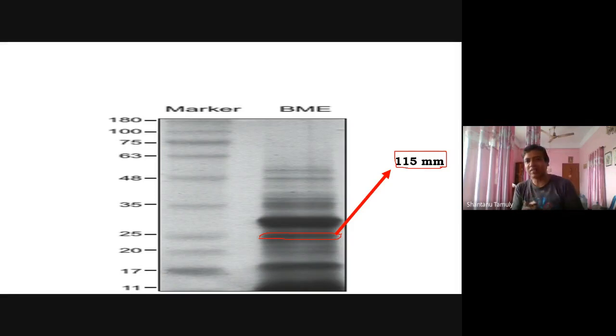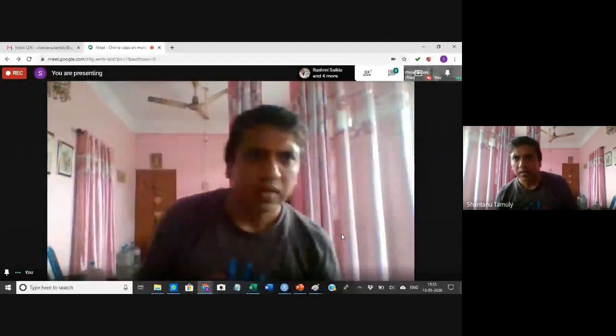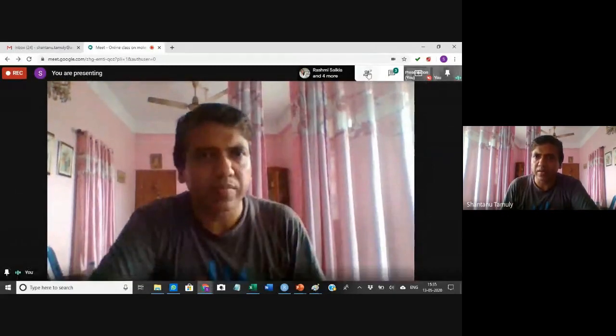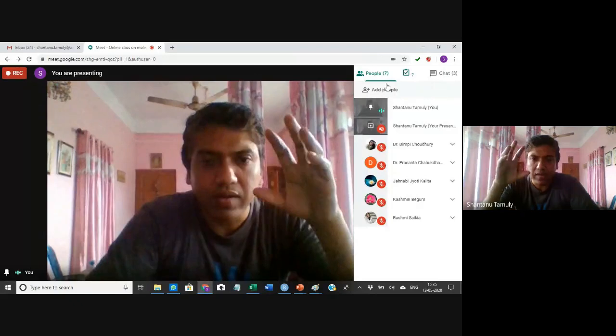Then you can say that this protein could be the one you have searched through literature. So this is how we do the analysis in an Excel sheet.